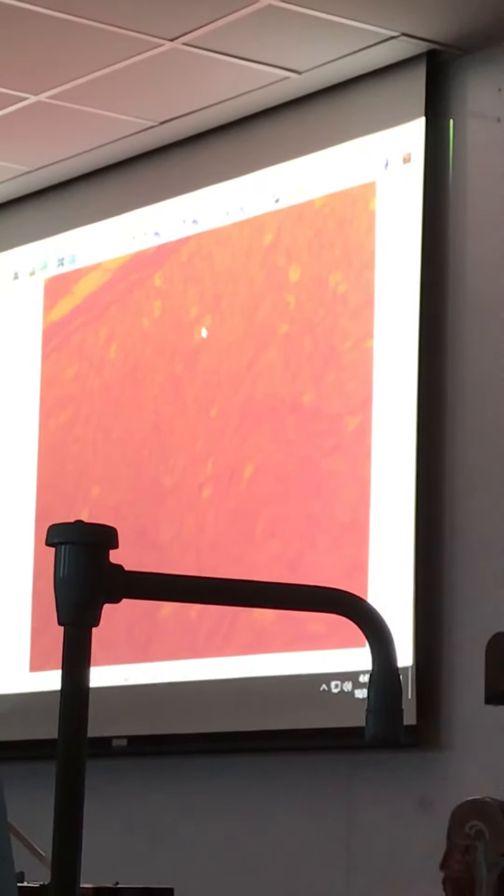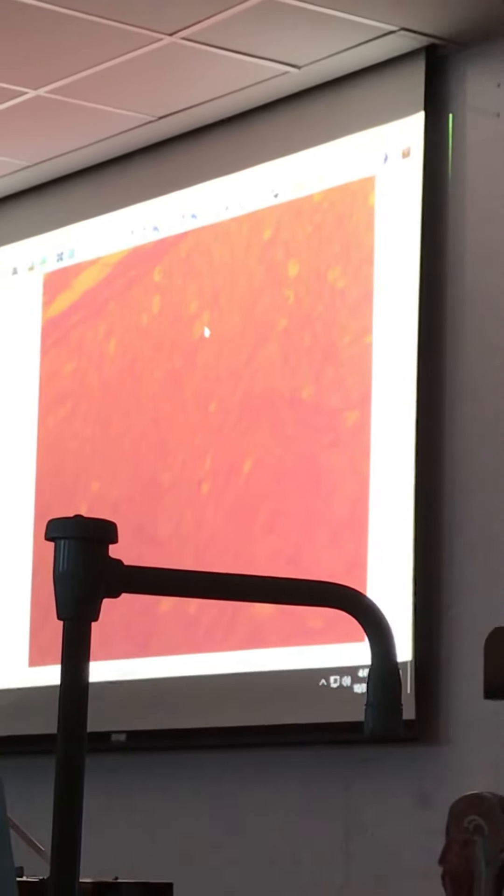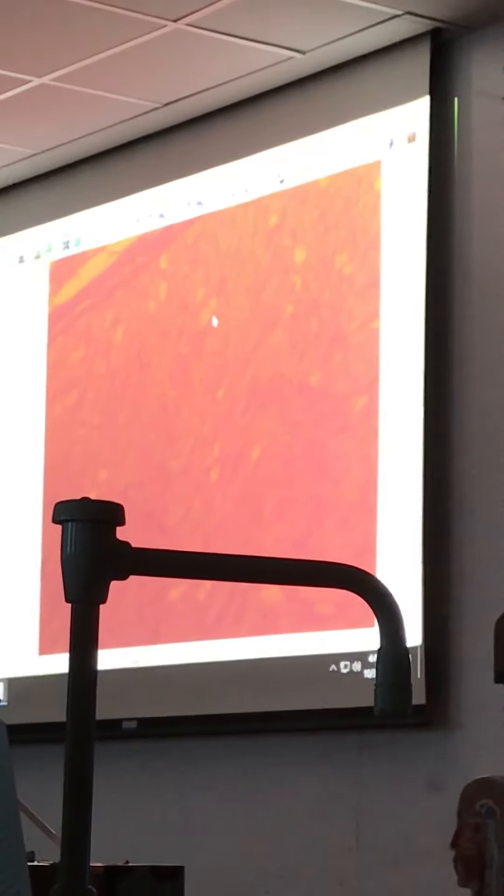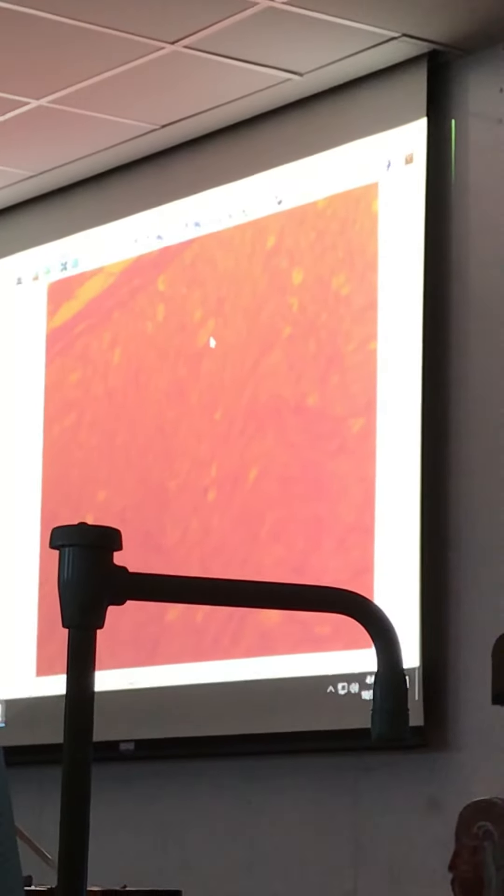You can see the axon inside. You can see the myelin sheath. And you can see this constricted area which is the node of Ranvier. So if you want to take a picture of this or find this in your own myelin sheath.